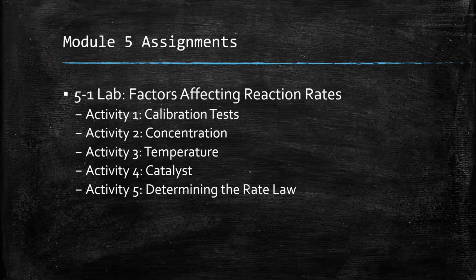Lab Activity 5-1, Factors Affecting Reaction Rate, has 5 activities this week. You will explore how concentration, temperature, and the addition of a catalyst affects reaction rate, and you will experimentally determine the rate law for a reaction.